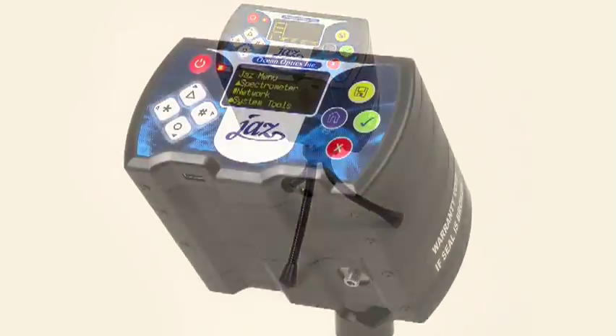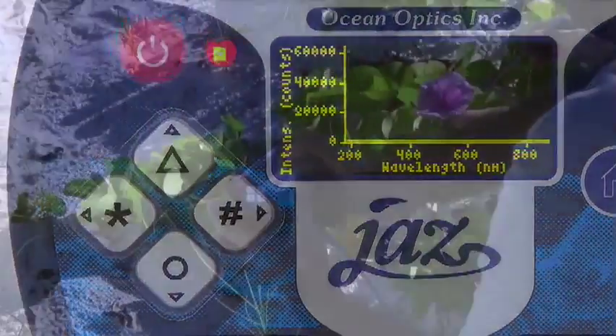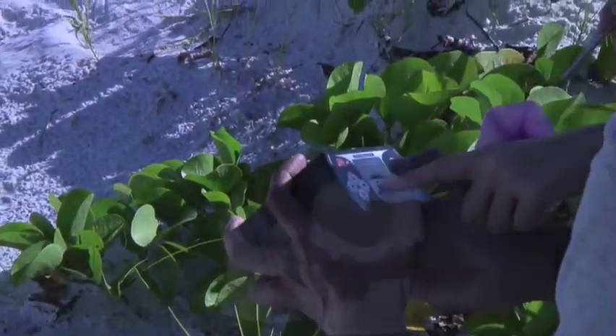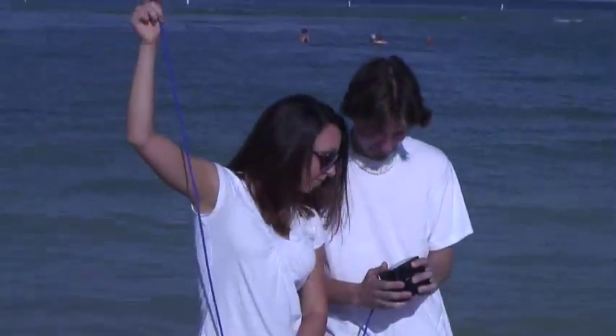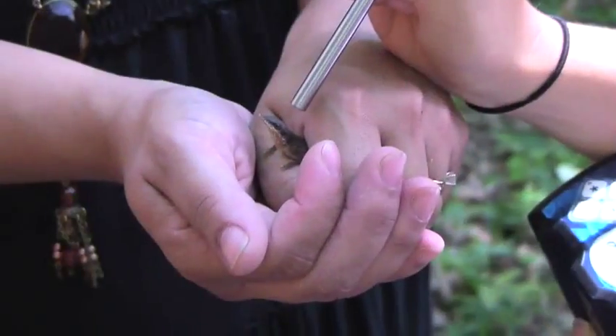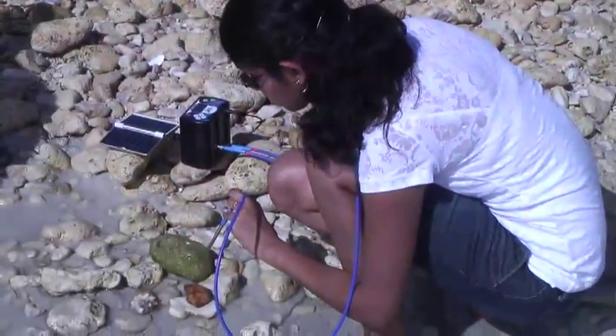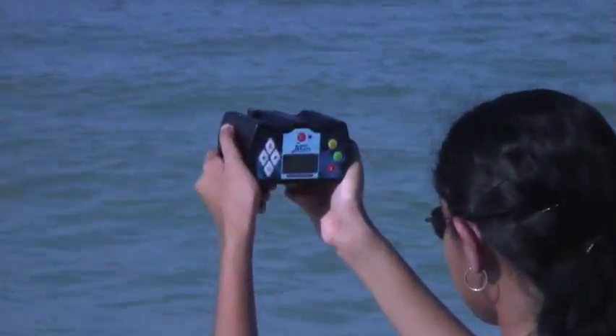Thank you for choosing Ocean Optics' most innovative spectrometer to date, JAZZ. The compact, modular design and Ethernet connectivity makes JAZZ the first of its kind — a completely autonomous spectrometer, perfect for both laboratory and field work. In this video, we'll demonstrate the basic steps and functions of your new JAZZ spectrometer.